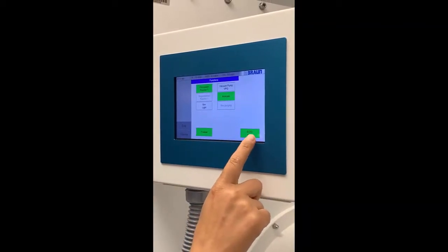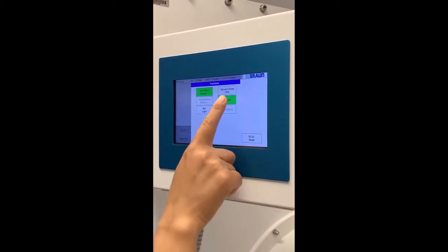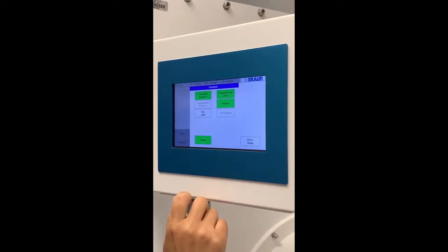So first you must turn off eco mode, then turn on the vacuum pump, and turn on the box light.